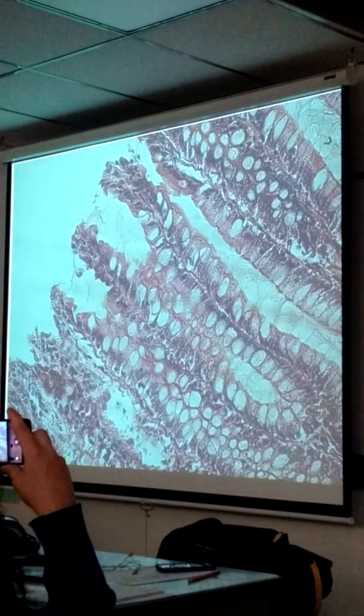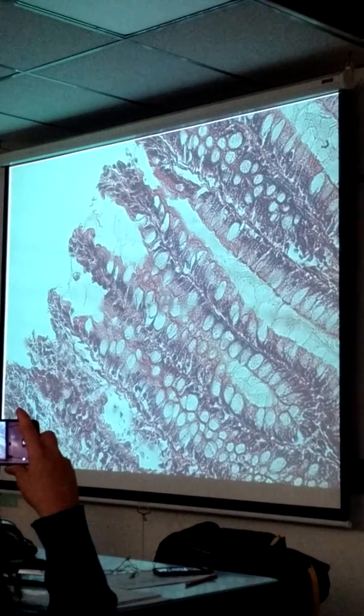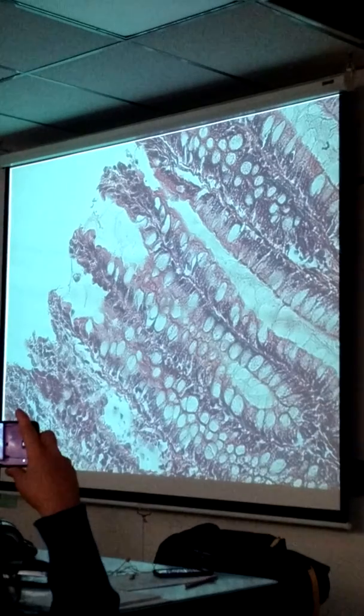That's the physiology part. But needless to say, you might have to identify the goblet cells. They are very important for colon function.